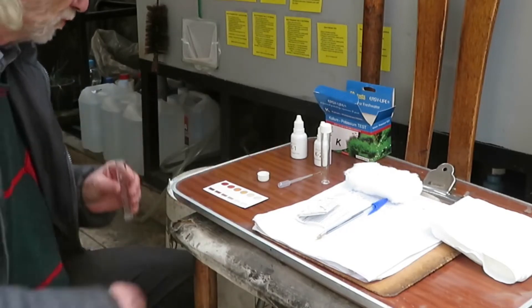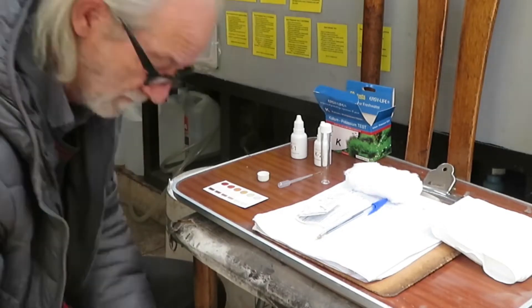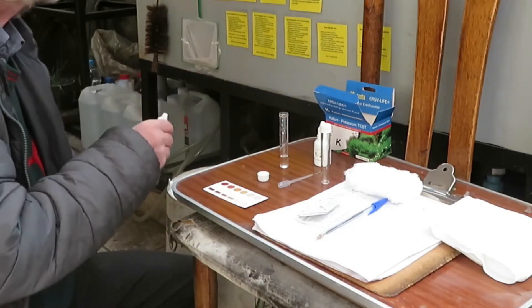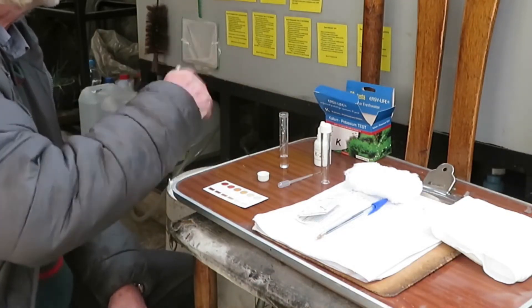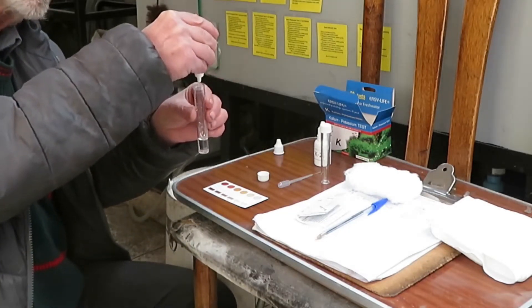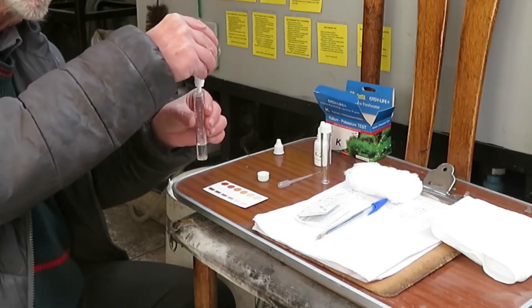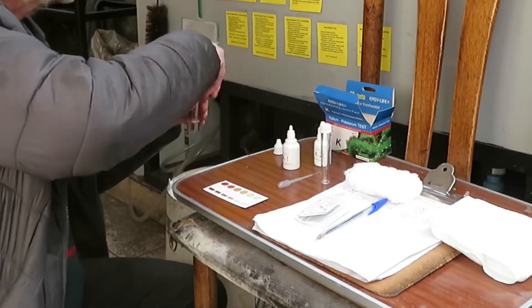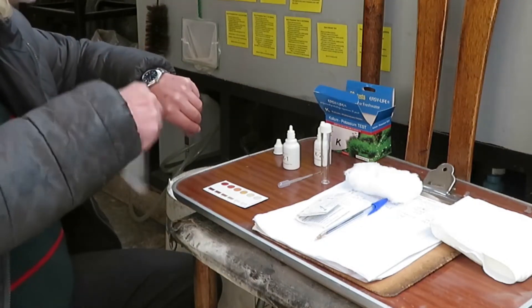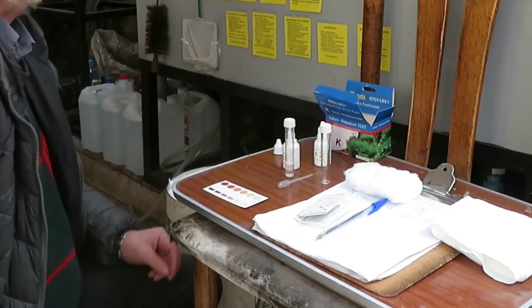We fill the vial with two milliliters of water from our aquarium. We add ten drops from reagent one. We shake it firmly for thirty seconds and we wait for six minutes.